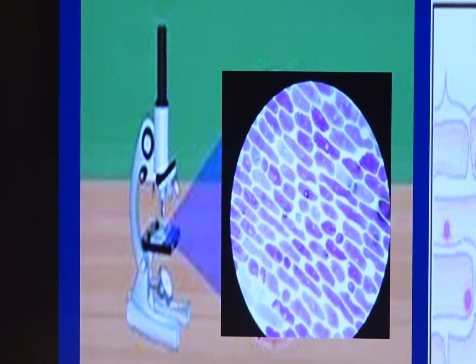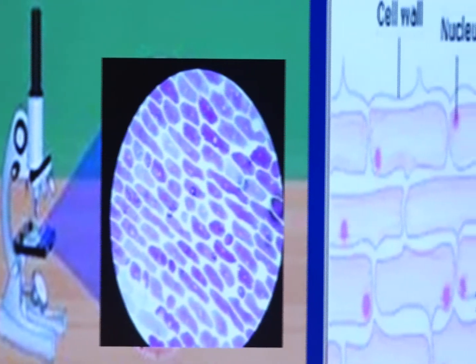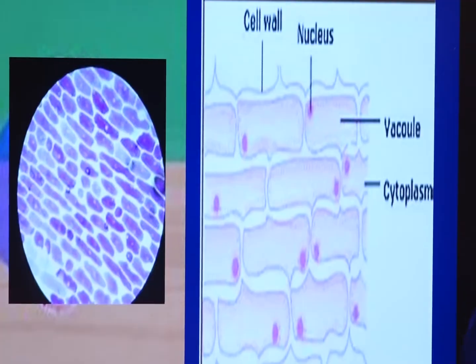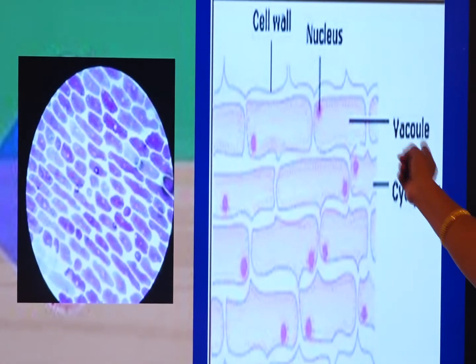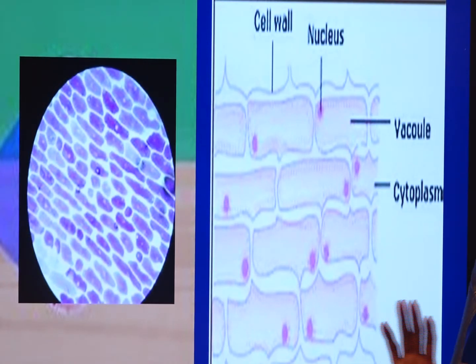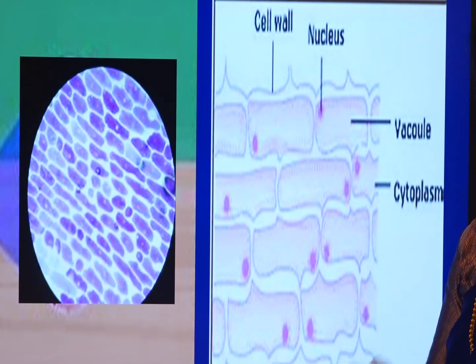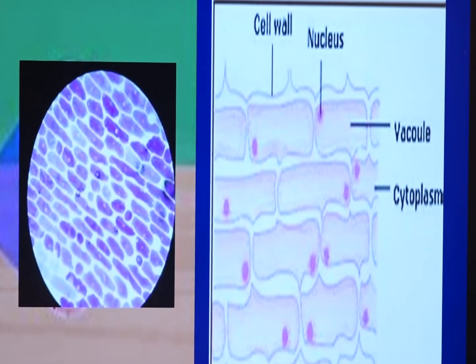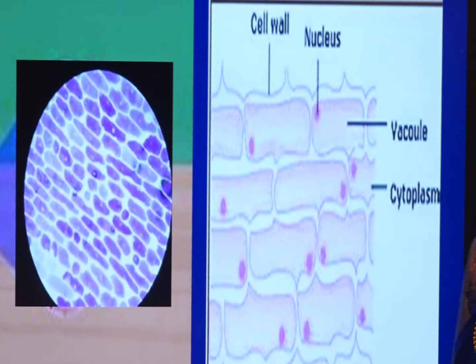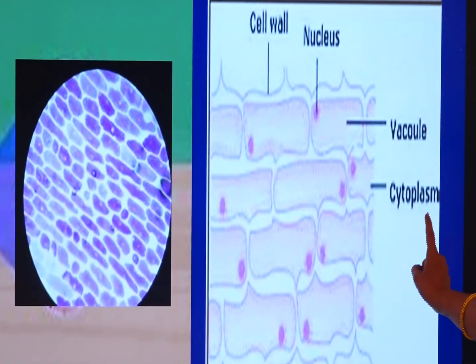When we observe the microscopic view of the nucleus stained from onion epidermis, you will find a microscopic field containing cells. When we observe the cell, it is a plant cell. It has the cell wall, the cytoplasm, the vacuole, and the nucleus. The nucleus takes the stain and is visible in the cell.